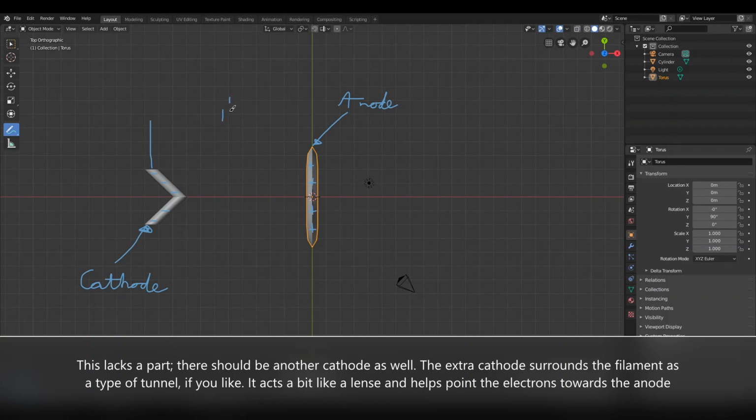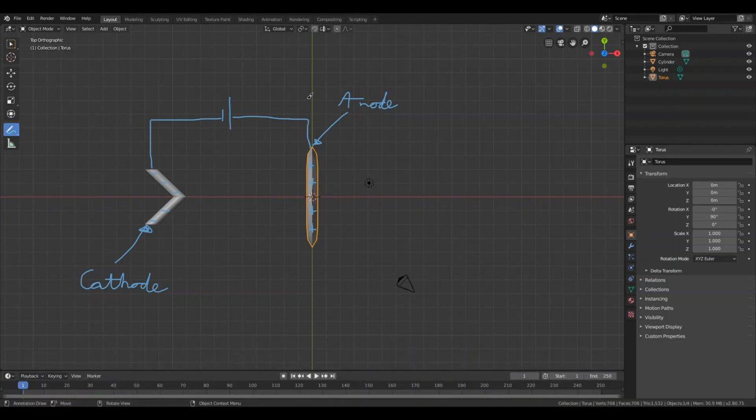So this is like a symbol for something generating voltage, or really a battery symbol, and it's not a battery. I would be impressed if you had a battery for this. So between these two, you have a quite powerful, quite high voltage.